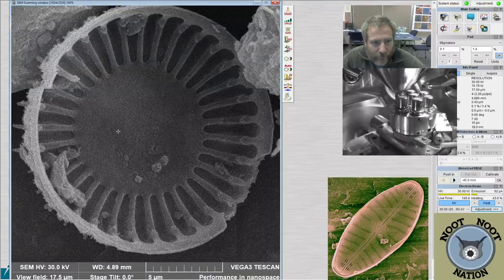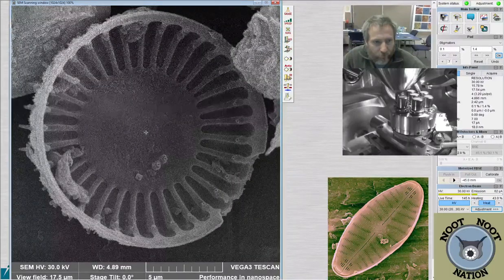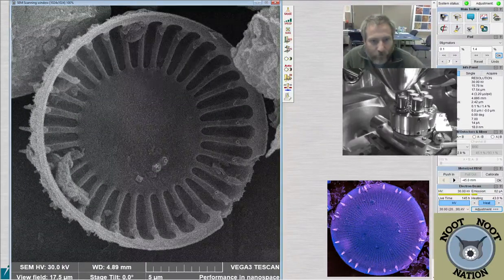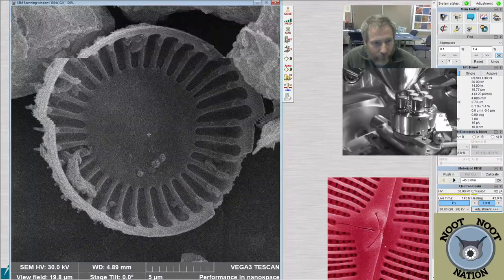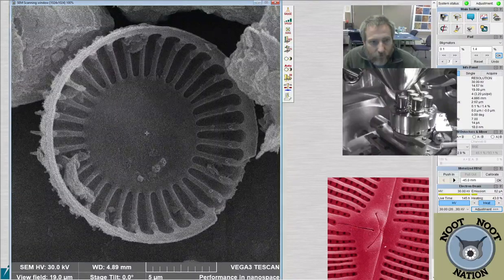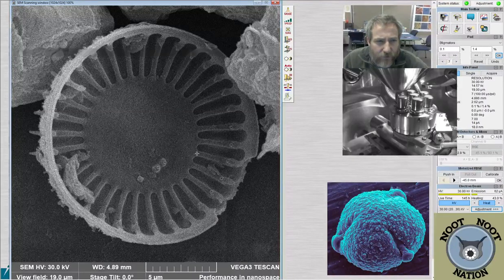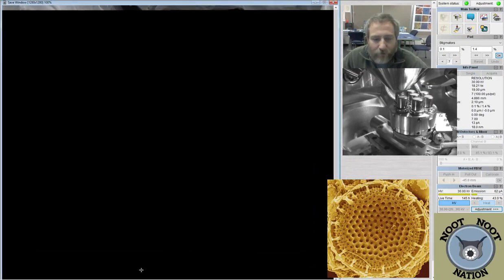And also, if we look on the other side, because of the way it's tilted a little bit, because it's sitting up on this silt grain, spines, which is common for Cyclotella, but none of the other organisms that we see usually, except for Stephanodiscus. A typical Lindavia or Discostella don't actually have spines. So, kind of nice to be able to see those as well. And this will probably be okay for the poster as well. It looks like the quality is pretty good. I didn't see any weird lines from the silt grains coming through the sample. So just hopefully it stays that way.